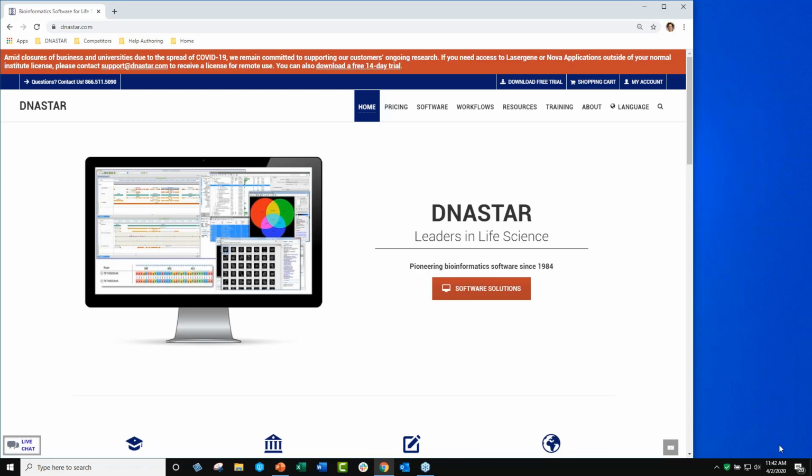But whether or not you can access your data or your work email, because some of you don't have access to those, one thing you can always do from home is just learn how to use Lasergene more effectively by checking out some of our training videos or our tutorials. They have free practice data.